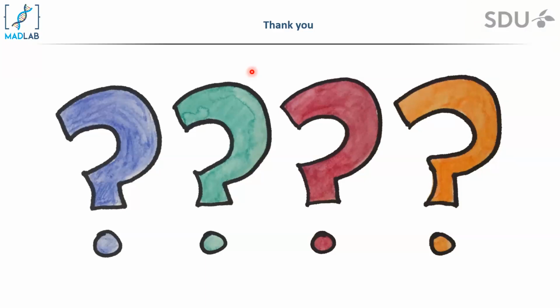Thank you very much for the great talk. I have a question about identifying the empty droplets in your knee plot analysis. I know that you use localized linear regression. Have you compared how it performs with the approach used by CellRanger? I think CellRanger was using the knee point detection method of EmptyDrops, and that finds a more stringent point on the graph than we do.